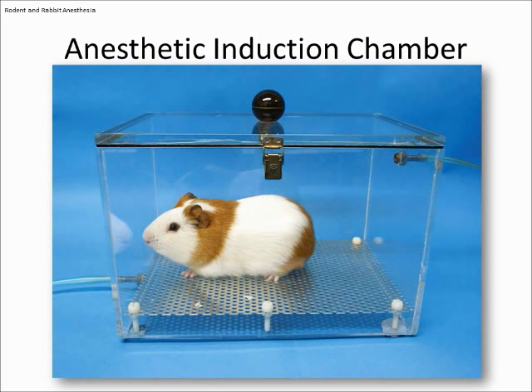Very good. When you exhale, that warm air, what is it going to do? Naturally tends to rise. And so if you have an active scavenging system there, this method in, out, would be the safest route here. If it was sucking in from here, there's actually most likely all your good gases down here. Nothing's going to happen down there. It's not going to be very regular. So now what you'll see in most cases, though, are two side by side, usually kind of middle of the PVC box here.